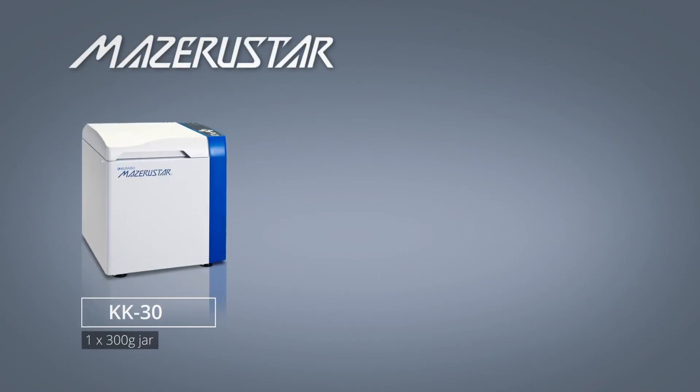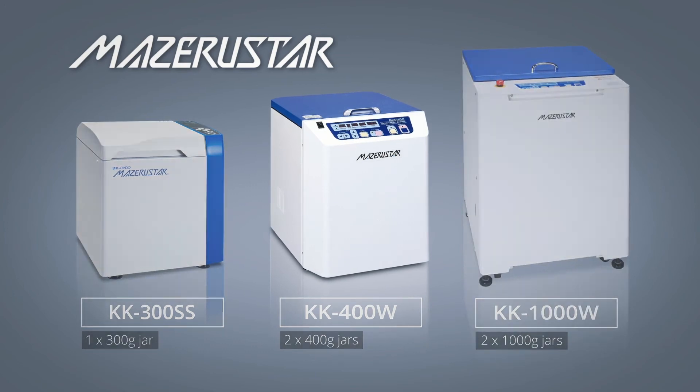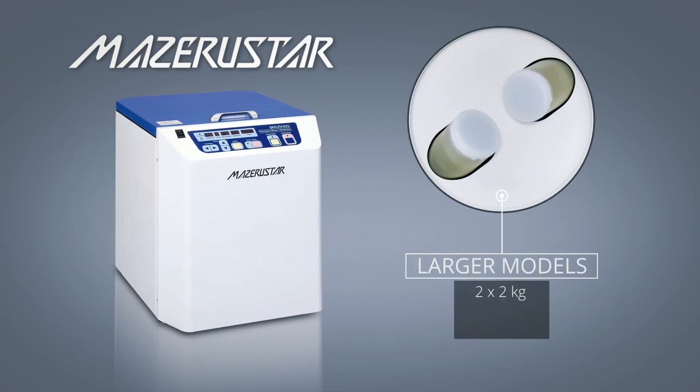Medisca's family of MESS products are suitable for a wide range of compounding practices. However, larger capacity models are available to hold 4, 10 or even 20 kilograms of product.